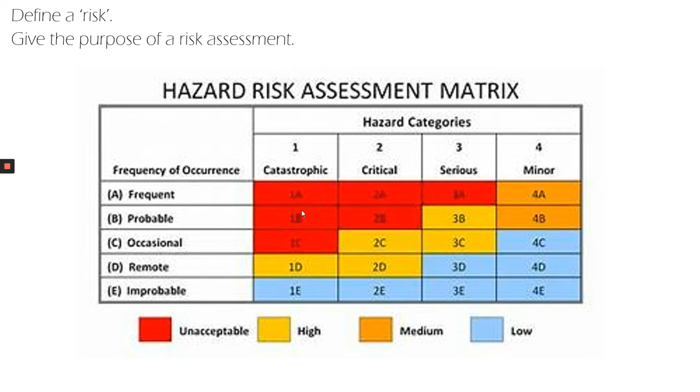The risk is the likelihood of a harm arising from exposure to a hazard. Every time a new piece of equipment is brought into a lab or a new chemical ordered or technique carried out, the overall safety is assessed using a risk assessment. In a risk assessment, the likelihood of a harm is judged for the new hazard and is given a rating, so low, medium, high. So if it's unlikely that a piece of equipment will cause damage or harm, it's given a low rating. If it's likely that it could cause a high degree of harm, it's given a high rating.